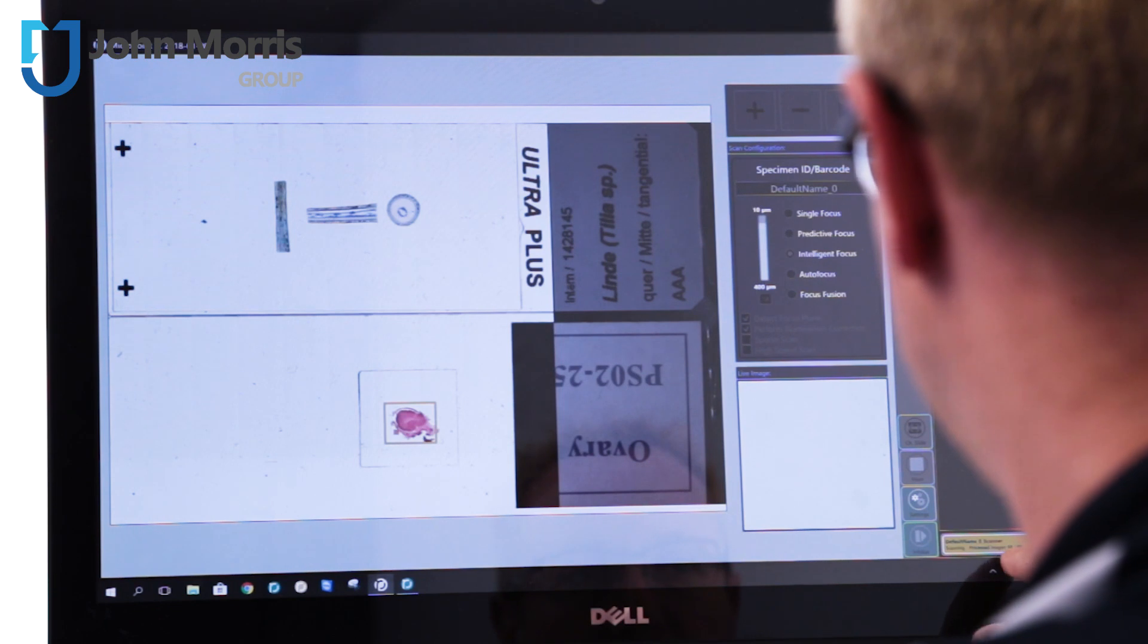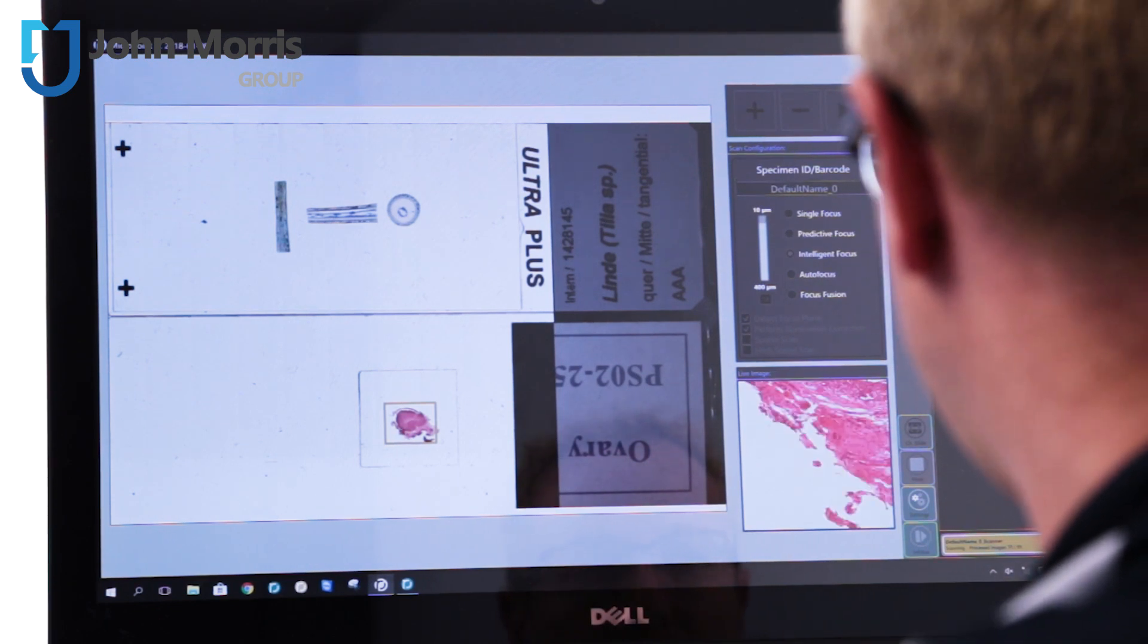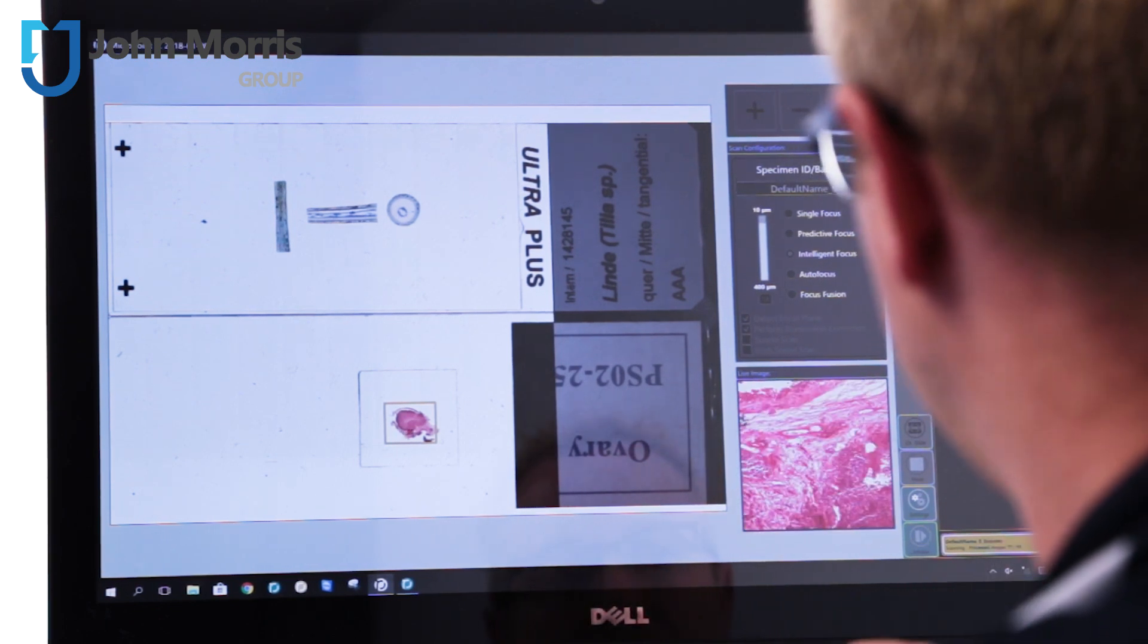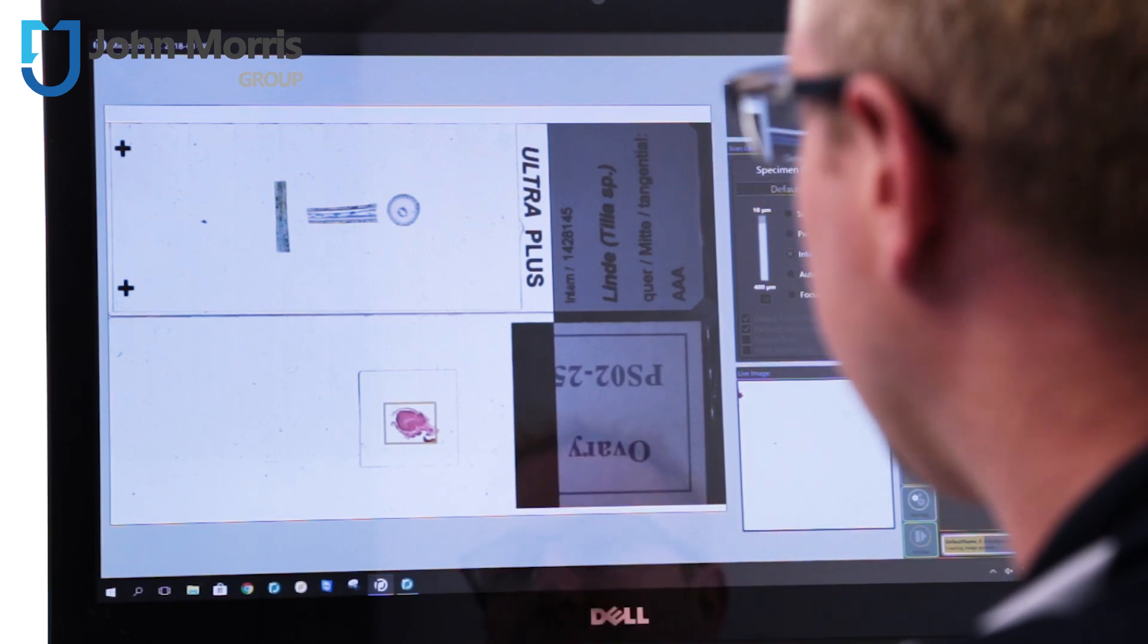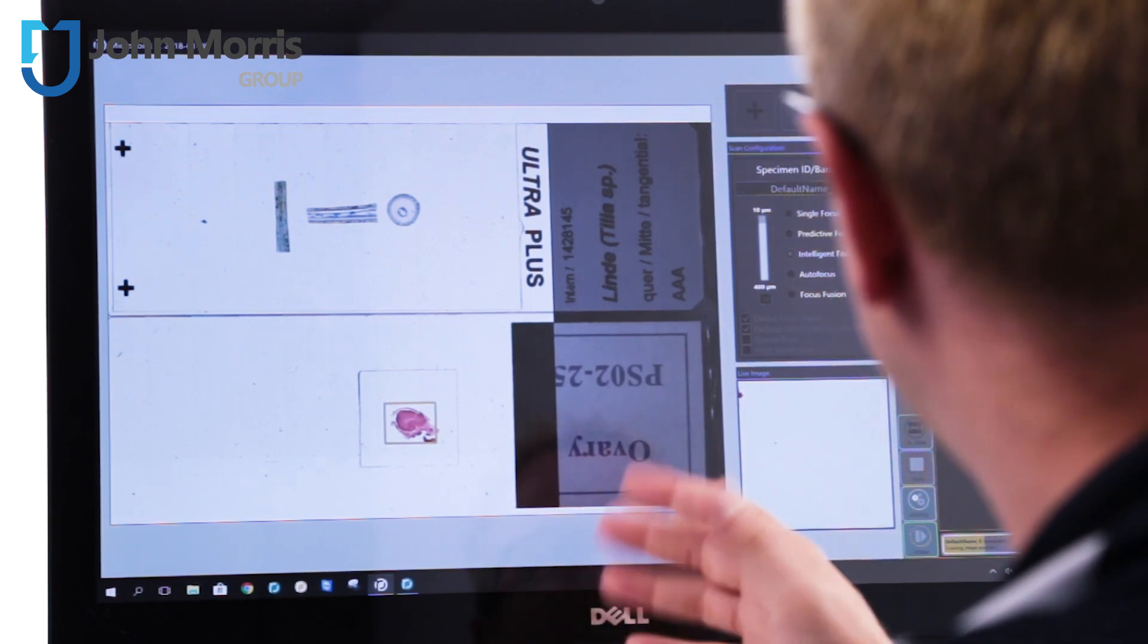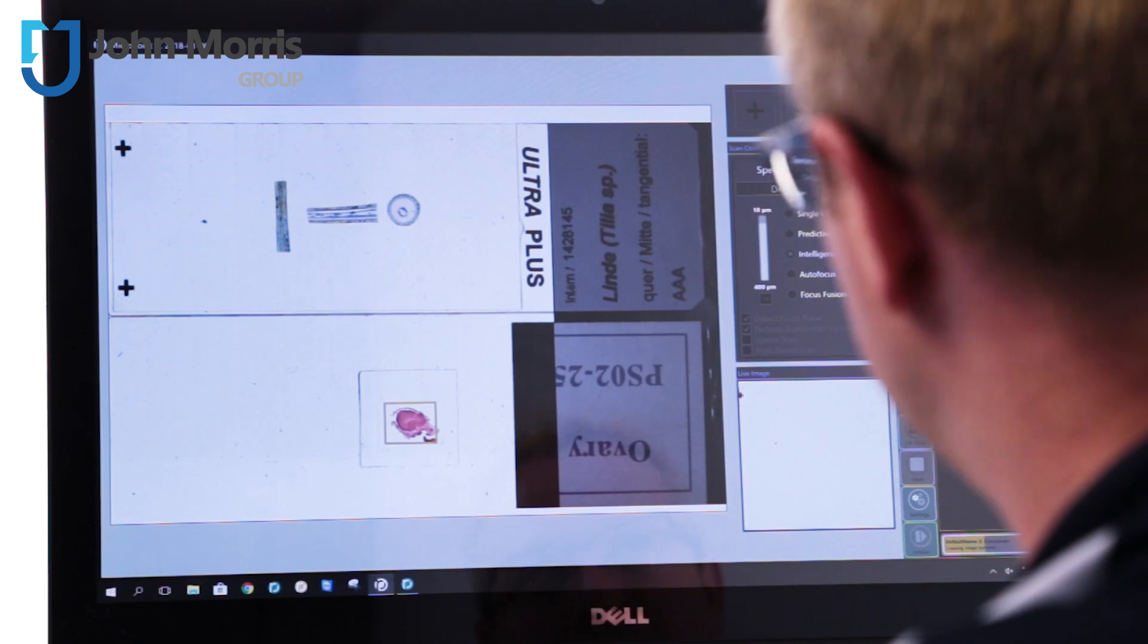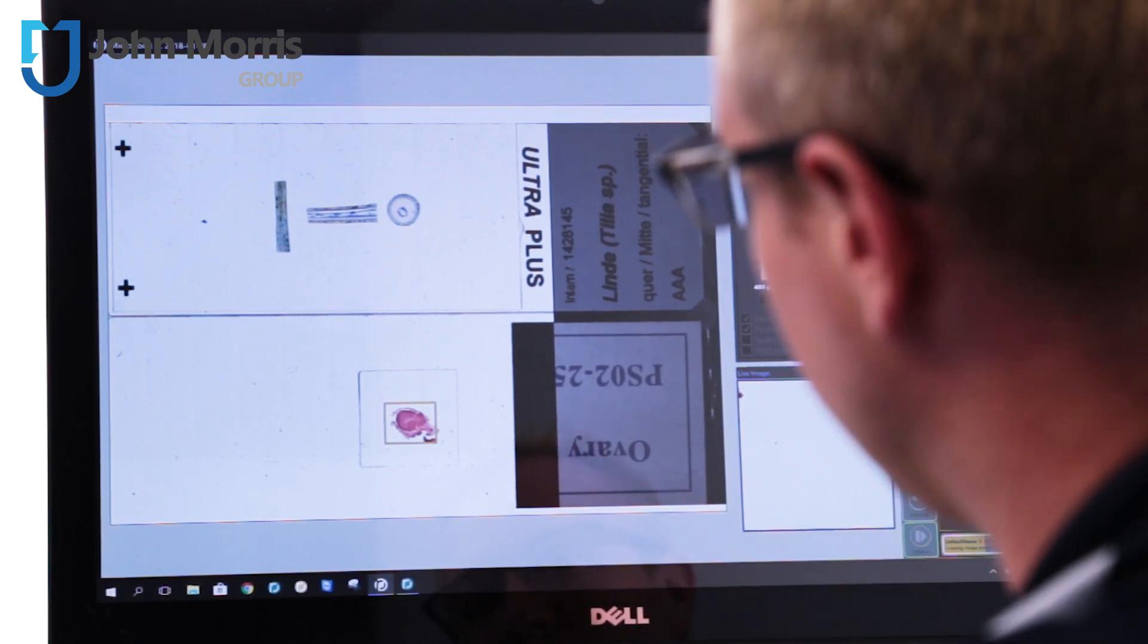So you can see here it tells you you're 67 or 68 through 99 images that it's going to stitch together for you. In this particular case we've scanned a reasonably large area. If we scanned a more defined area you might expect an entire time of say 30 seconds rather than the two or three minutes that we've got right here.